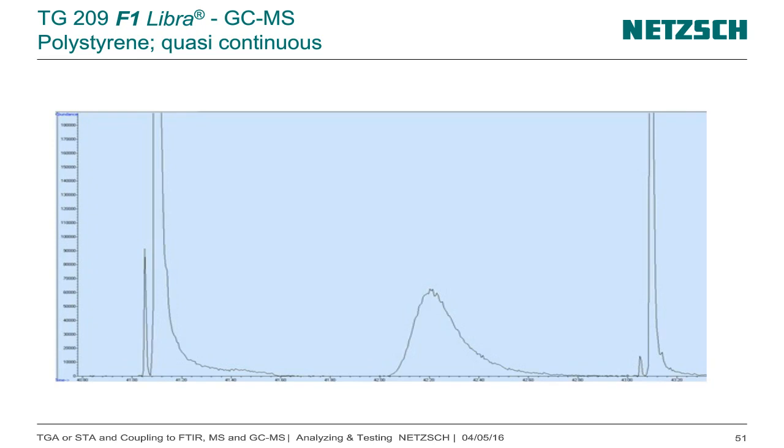And here is an extraction of the different valve switches. So you see here a sharp peak in the beginning, then a high peak which I cut a little bit, and then a broad peak in the middle, and then again a sharp small peak with a bigger peak, and this is the second injection. So it's a 2 minutes time difference.